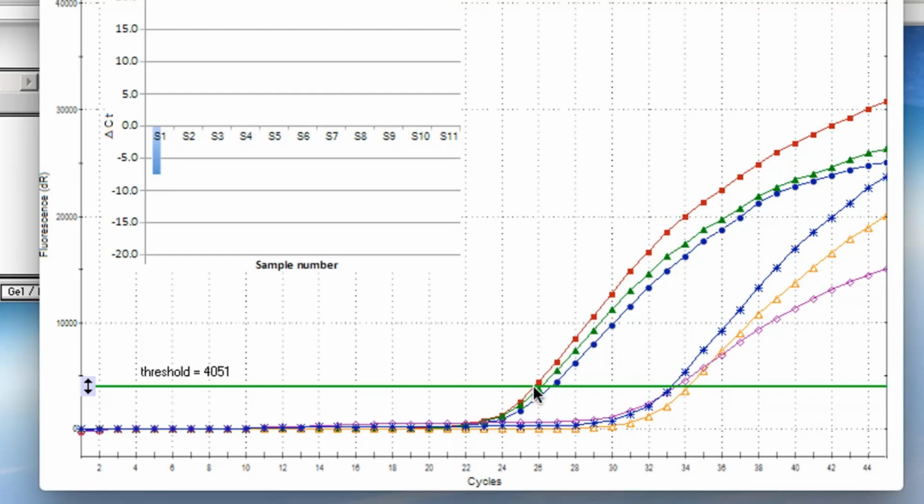However, the CT value here is less than the CT value here. Again, smaller CT values are associated with more initial copies of DNA. The way this works by convention is we're going to subtract the average value of this larger number from the average value of this smaller number, so you end up with a negative value, and that's why the bar goes down. You might have to think about that a little bit, but that's the convention that's used with qPCR.